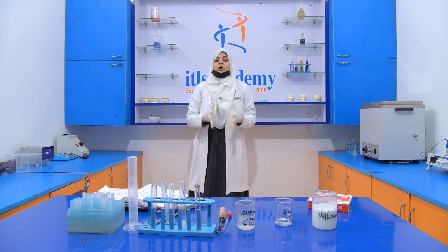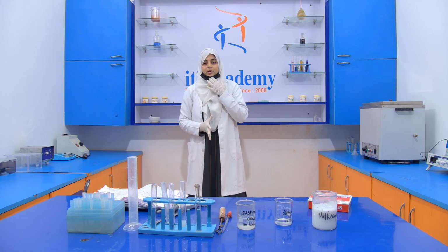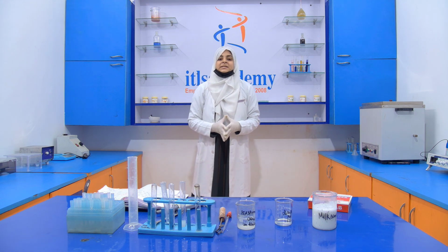Okay, so this is how we perform the detection of mercuric chloride in a milk sample.